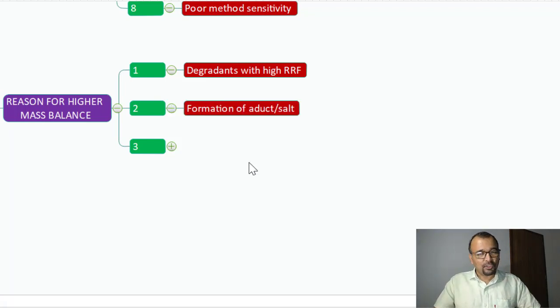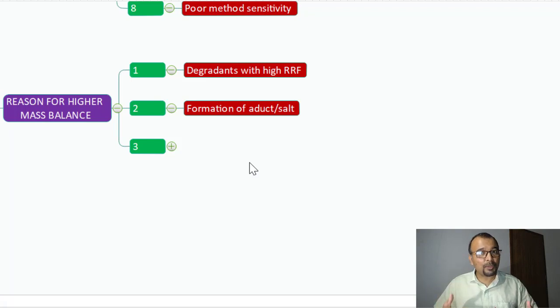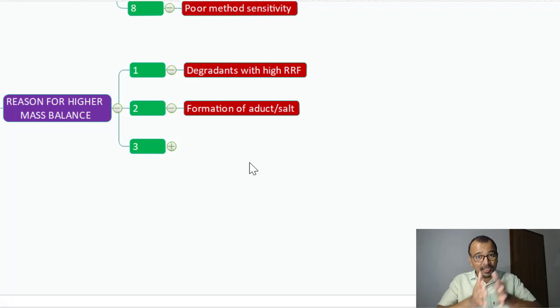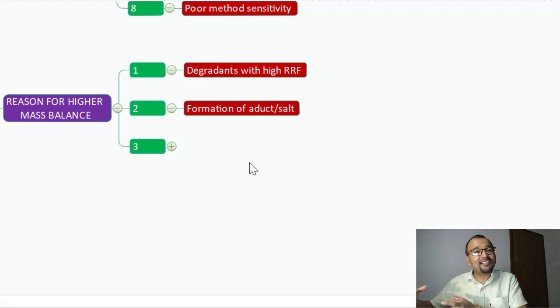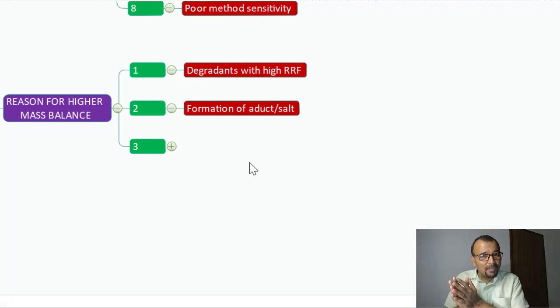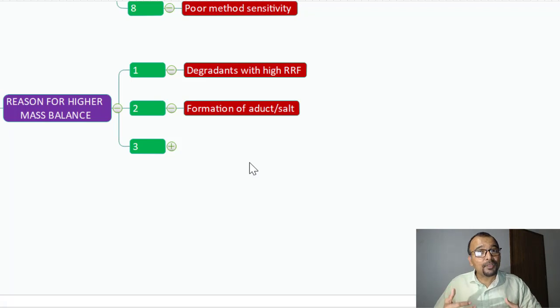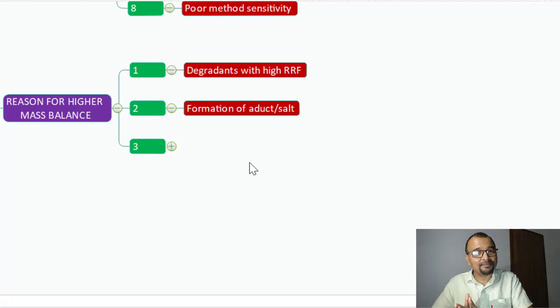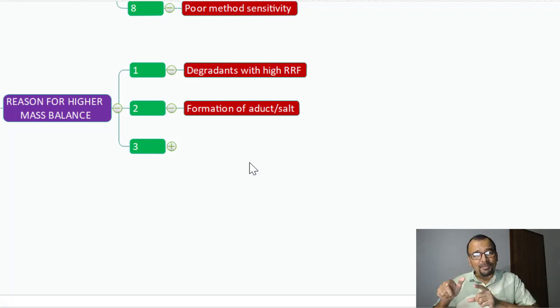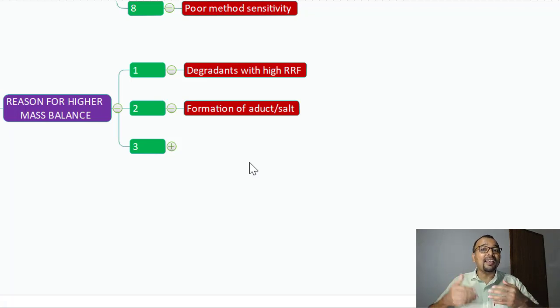The second reason for higher mass balance is formation of an adduct. In some cases, your API may form an adduct with excipients — in the case of drug product — or with degradation reagents. For example, if you have a dipyridamole API in a capsule containing tartaric acid, dipyridamole will interact with the tartaric acid to form a dipyridamole tartrate adduct. The tartrate part was never part of your dipyridamole earlier, and this additional mass you quantify will lead to higher mass balance.